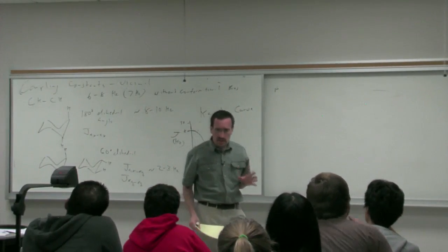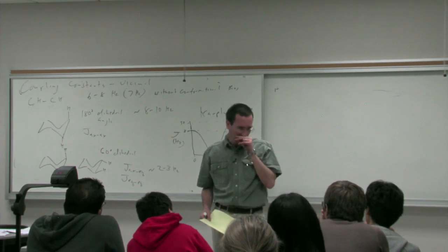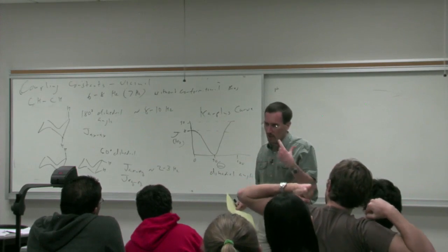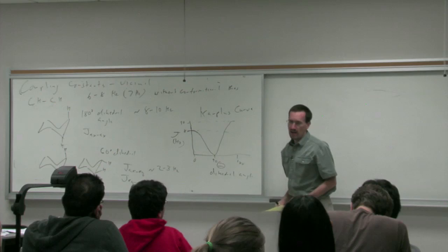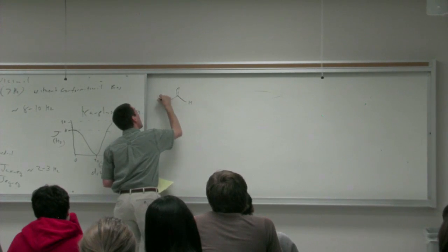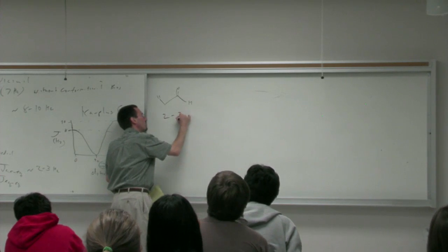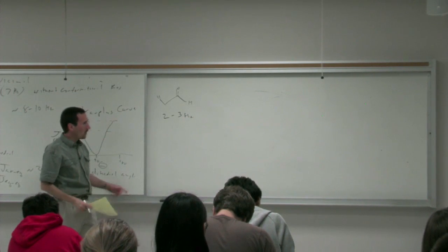The coupling constants are modulated by electronegativity and hybridization. In general, electronegative substituents lead to a smaller coupling constant. In general, if you've got an sp2 bond between the two atoms, like a double bond, you have bigger J values. So let me show you a couple of examples. As I said, the first number to keep in your head is about 7 hertz. But now if you want to think about some oddball situations, you can think of an aldehyde, where now you have an electronegative oxygen and you have an sp2 carbon here. Aldehydes are very funny in that your coupling constant is on the order of 2 to 3 hertz. So that's sort of unusual.